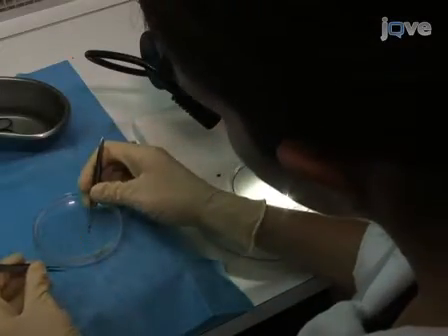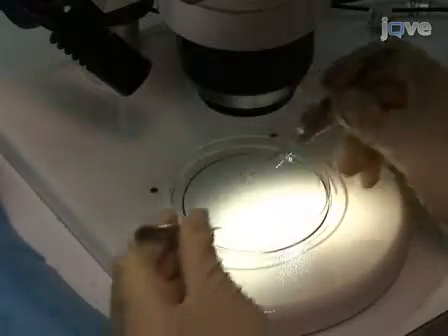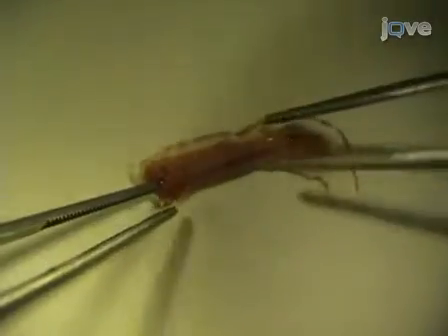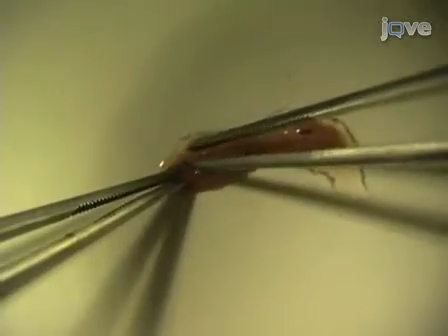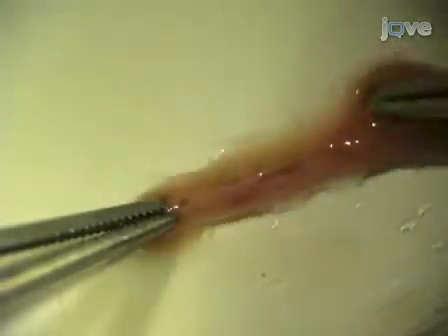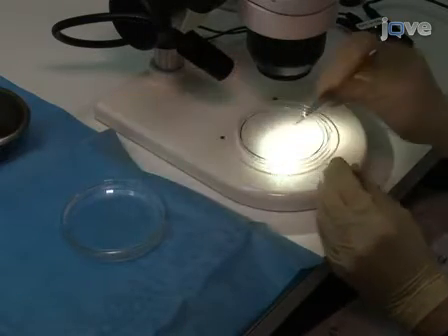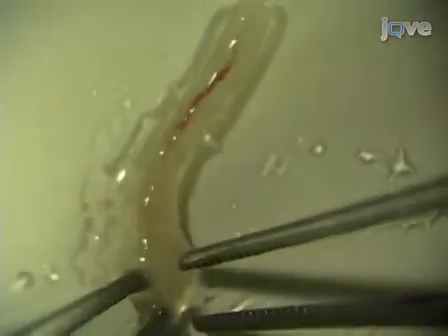Using two sterile tweezers and working under a binocular, clean the thoracic aorta from surrounding fat tissue. Make sure not to damage the aorta and hold it only at the edges. The aorta should be repeatedly immersed in the PBS-containing petri dish to prevent dehydration until it is finally cleaned.